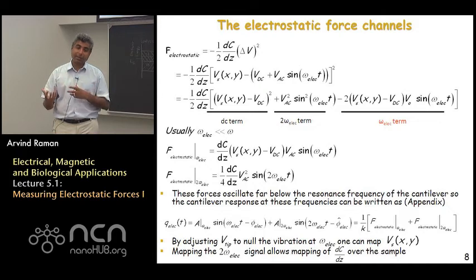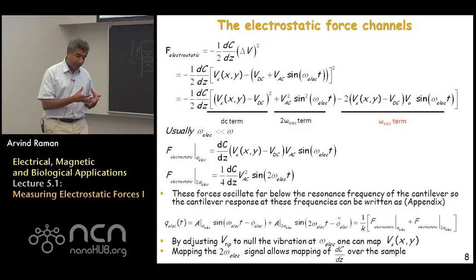This is related to the electrostatic force applied by the expression shown on the right, which is related to the cantilever stiffness K. Again, this is derived in some more detail within the appendix. So the idea is that one is measuring the tip motion at omega elec and at 2 omega elec.